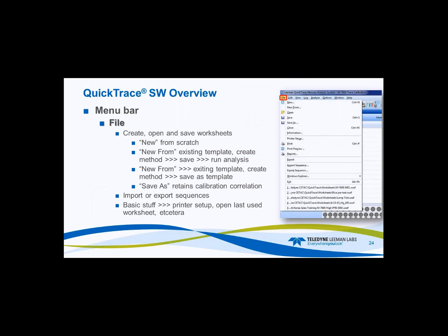So what I'm going to do is I'm going to come across the menu bar and give you a quick overview of the menu bar items, and then we're going to go into the favorites bar. And throughout this, I'll be talking about pop-up menus and different things like that, and pointing you towards tricks and shortcuts to make your experience a little bit better.